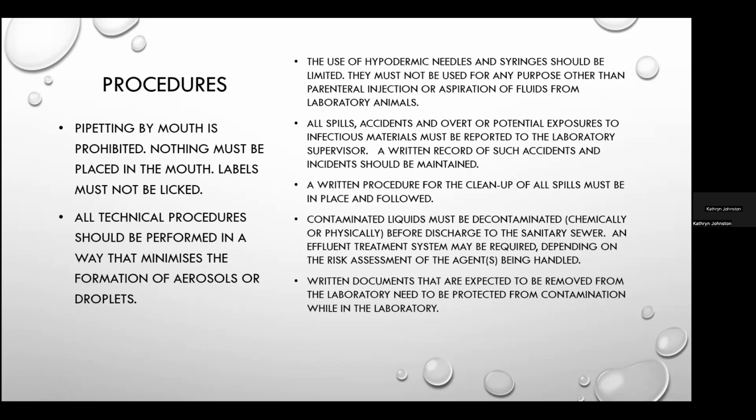We talked about safe injection practices, and the use of needles and syringes should be minimized if at all possible. And if you do have to use them, the use of safety needles is recommended because they protect healthcare workers from needle stick injuries. There should be a written policy and procedure for the management of blood spills, as well as exposure to blood and other potentially infectious material.